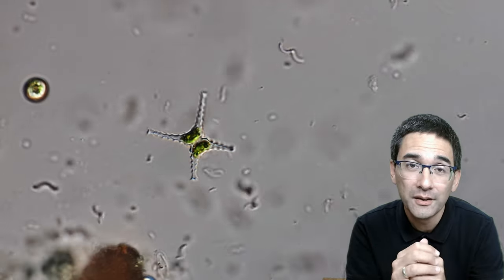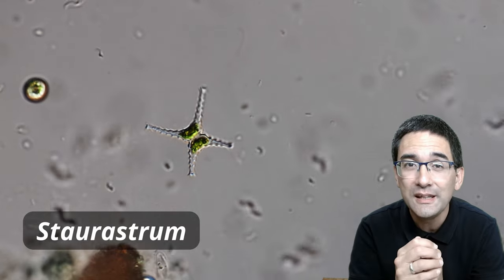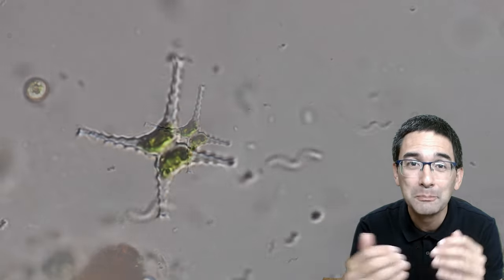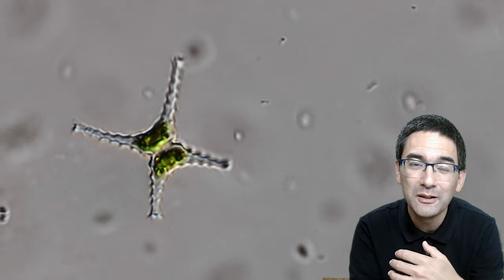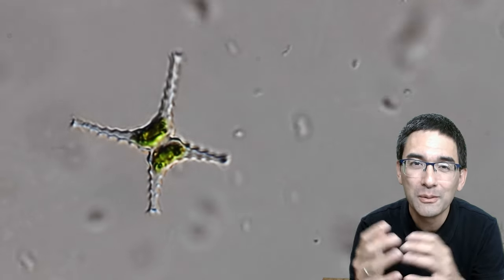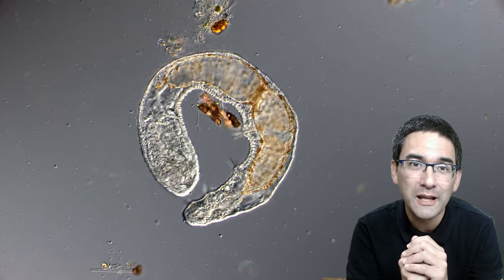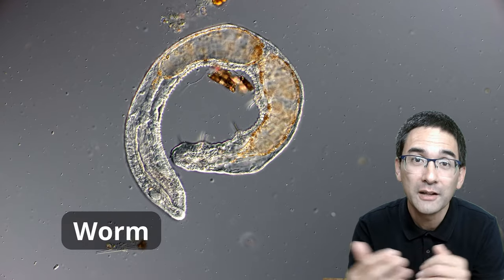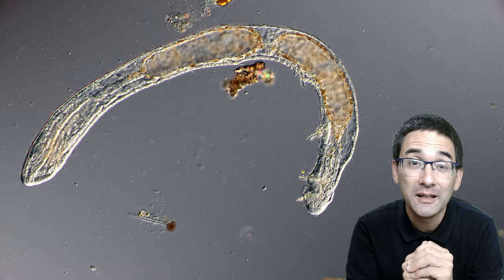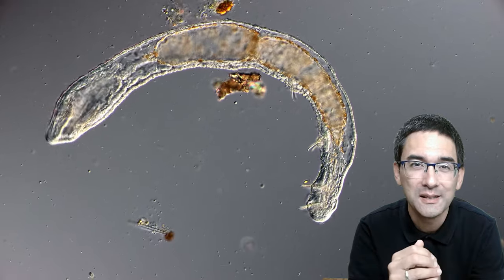I did find some other nice algae. You know they're algae because they're a little bit green on the inside — those are the chloroplasts. My identification book helped me a little, but there are so many different forms and shapes out there that it's quite likely some cannot be pictured in an identification book. Also another worm here — it's clearly an annelid worm, which is a segmented worm, because if you zoom in you can see the segments.